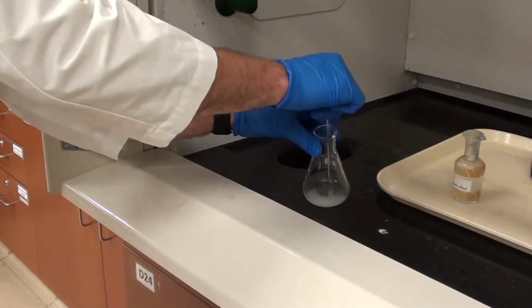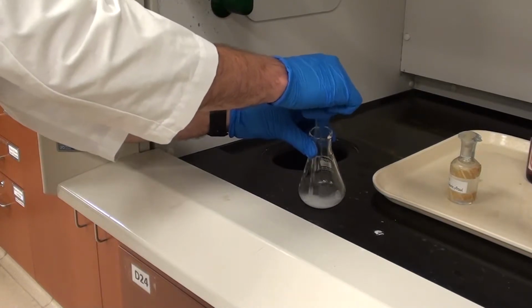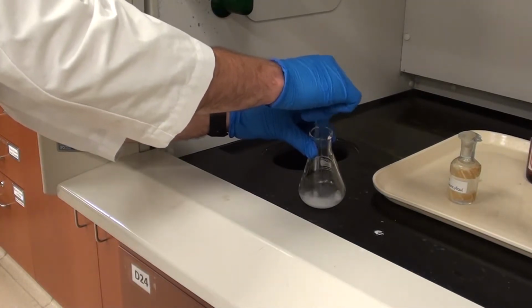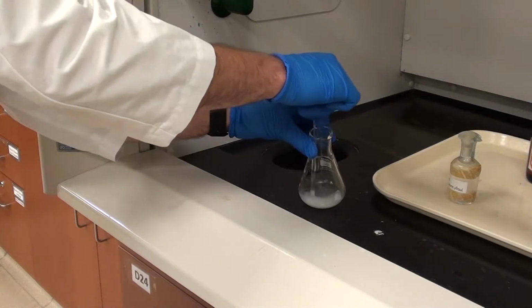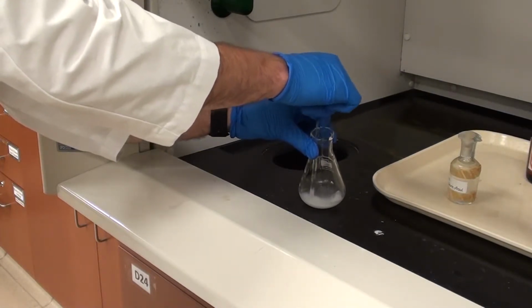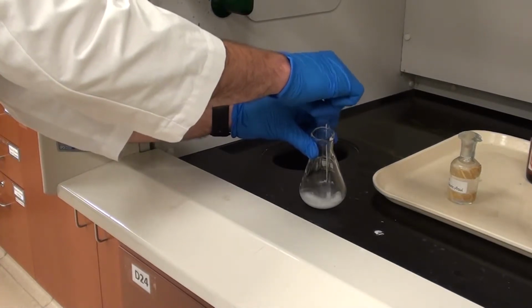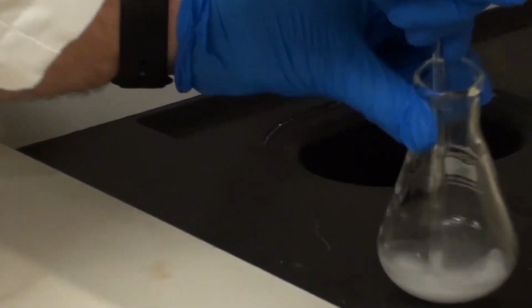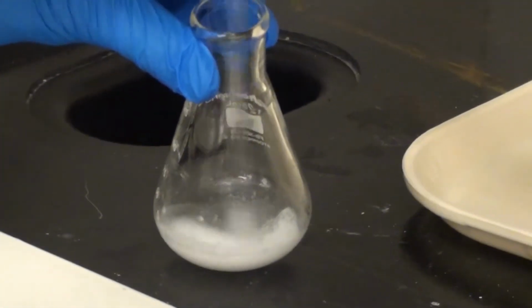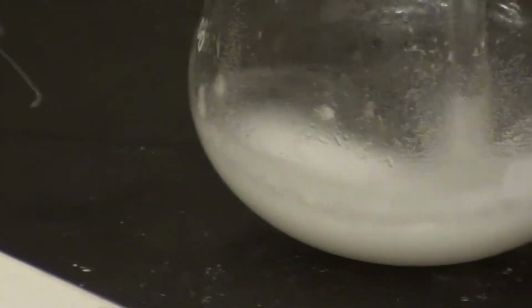So we've been stirring for another 5 minutes here, and you'll notice that the solution now is becoming cloudy. This is the aspirin beginning to come out of solution. So Matt is there, he's diligently stirring that, and wow, it's beginning to become a bit on the slushy side. I'm going to go ahead and zoom in on that so you can see the slushiness of it all.